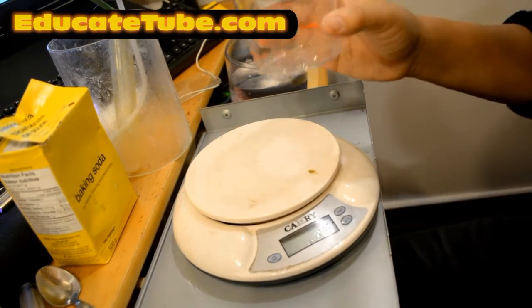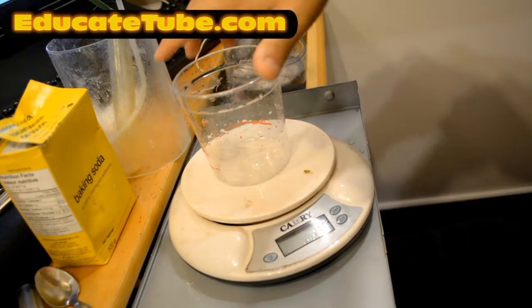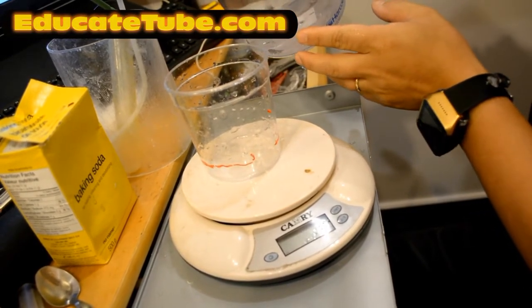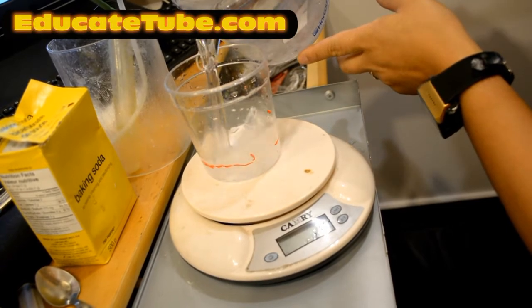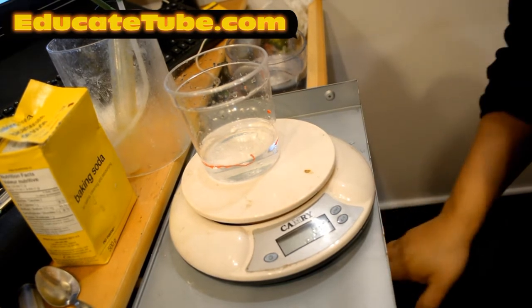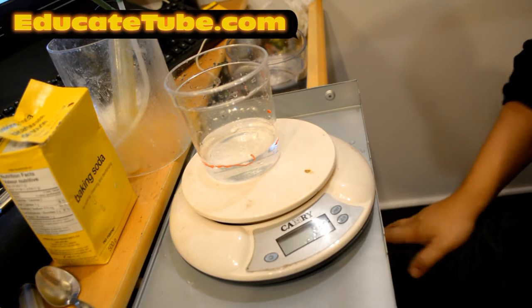Okay, I have another scale. I'm going to measure the amount of water that is displaced. So let's set this to 0. I'm going to pour the water in according to the marking that I made. Remember, the density of water is 1.0 grams per mL. So every gram shown here is a mL. There, that's about right. Oh, that's horrible. We only got 74 grams or 74 milliliters of gas displaced. That is a very poor result. I would have to repeat this again with better equipment.